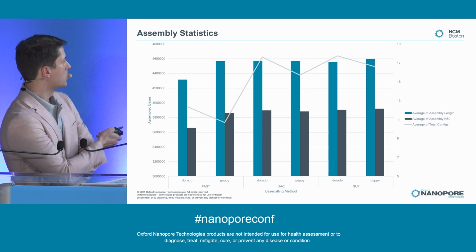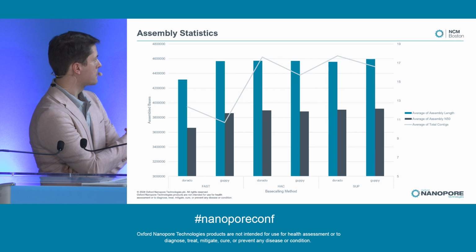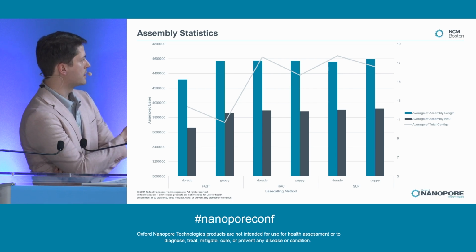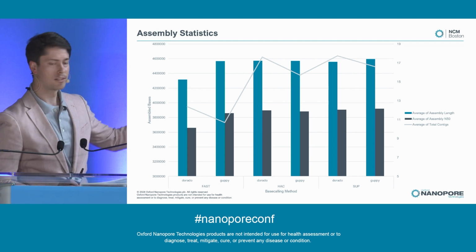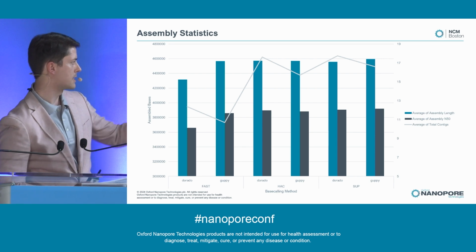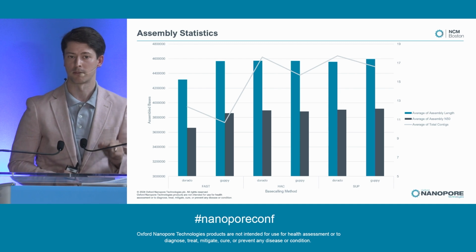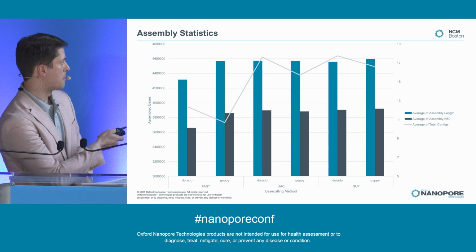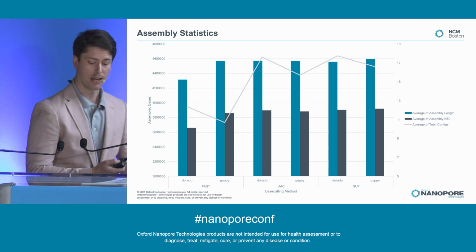What I do want to look at real quickly before I run out of time, which I'm rapidly doing, is that the contig count drops here. Usually between Dorado and Guppy, the contig count drops. But what's worth noting is the N50 stays very static. And without going into the details of how that's calculated, that does imply to us that all the contig differences between Dorado and Guppy, between the fast and the superior accuracy modes, are negligible. These are short contigs that are not providing very much information to the overall assembly. So maybe Guppy looks on paper as though it's a little bit better. This is about 1 contig difference, but in practice, you're not going to see that dramatic of an effect.